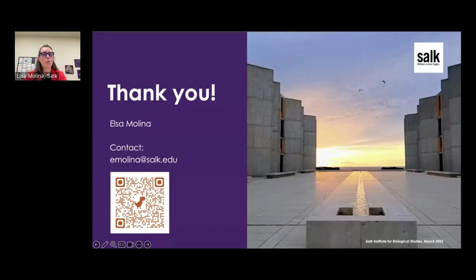For example, when we started running cells on Xenium, we of course contacted 10x Genomics to make sure we were not going to make any mistakes, and to have the best practices for running cells and not tissue with the Xenium.